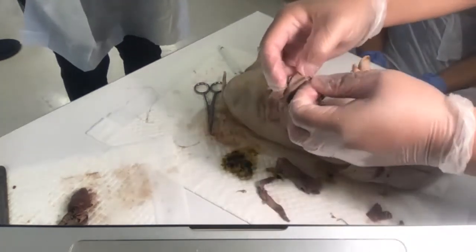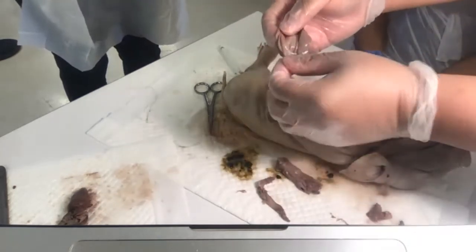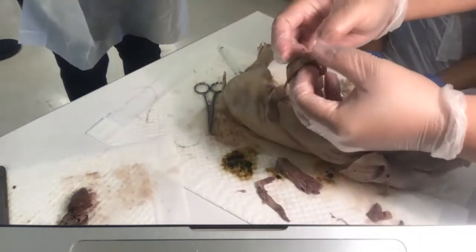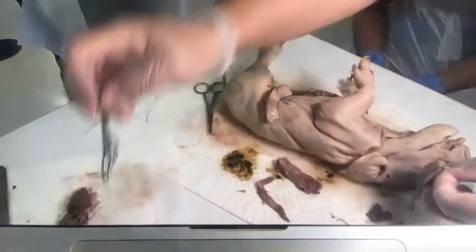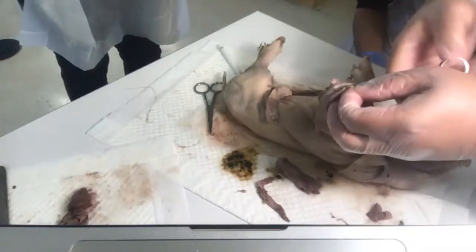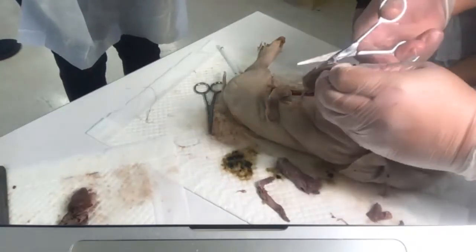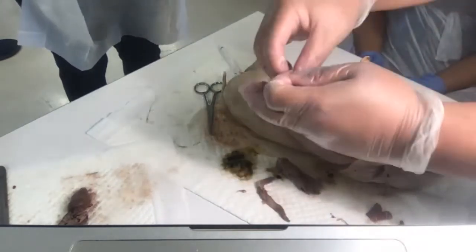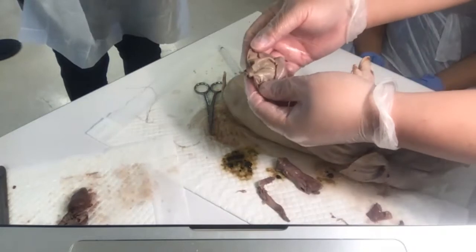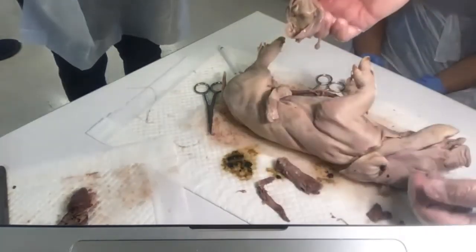And you could see how this is tough, right? And how it's a sac. That's all the muscle is, a sac of muscular layer. I mean, that's all the stomach is, a sac of muscular layers. So when I open it up, doesn't it look like, see all the folds? Those are called rugae. Doesn't it look like a deflated balloon?